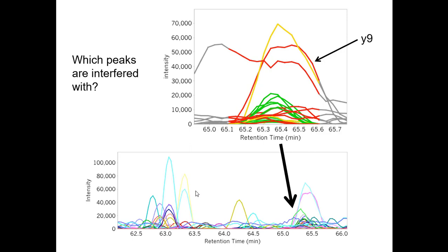You get enough co-eluting ions that evolve, they rise and fall together. But there are a bunch of these ions, so the ones in yellow maybe are useful for detection, but maybe aren't so good for quantitation. And that's what the Y9 ion is. It's this one that's a little bit higher than everything else because there's something else that's co-eluting with it.